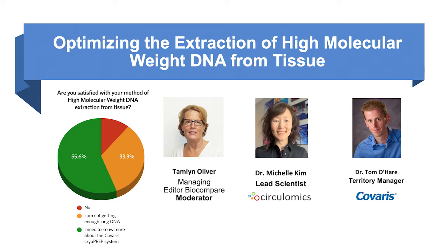Oh, yeah. We talk to a lot of people who have trouble getting high molecular weight DNA. And I think that a large part of it is that it's not something a lot of people do. A lot of people are getting high molecular weight DNA to do long read sequencing, but they're not doing it every day. So it's very understandable. Anybody is free to reach out to me. We will help you with it. And I think that using the cryoPREP definitely will help because disruption, as I mentioned, is a very critical feature of getting your final DNA of high size. Another thing is that a lot of people don't really know what kit to go to, and because there's a lot of differential results that you get from different tissues, that can be very frustrating for users as well.